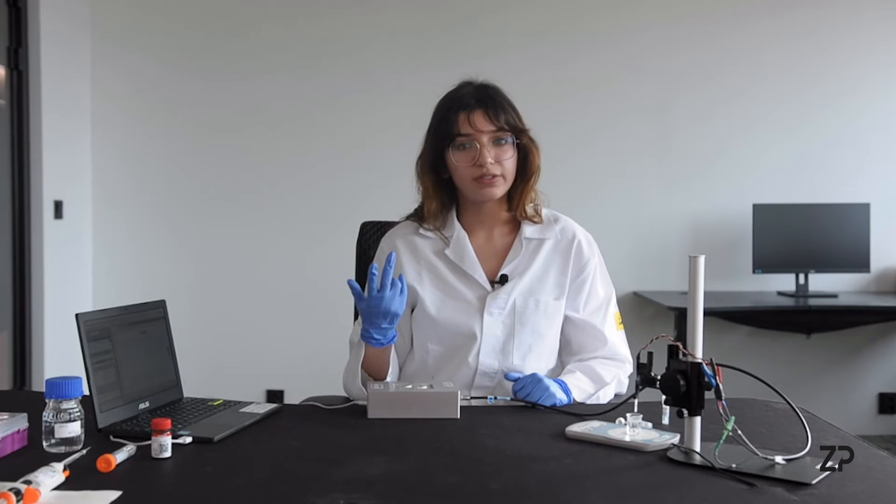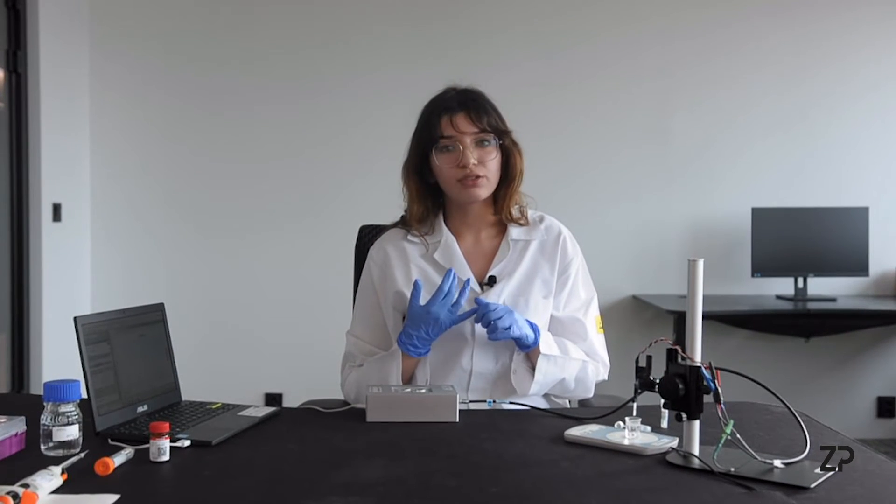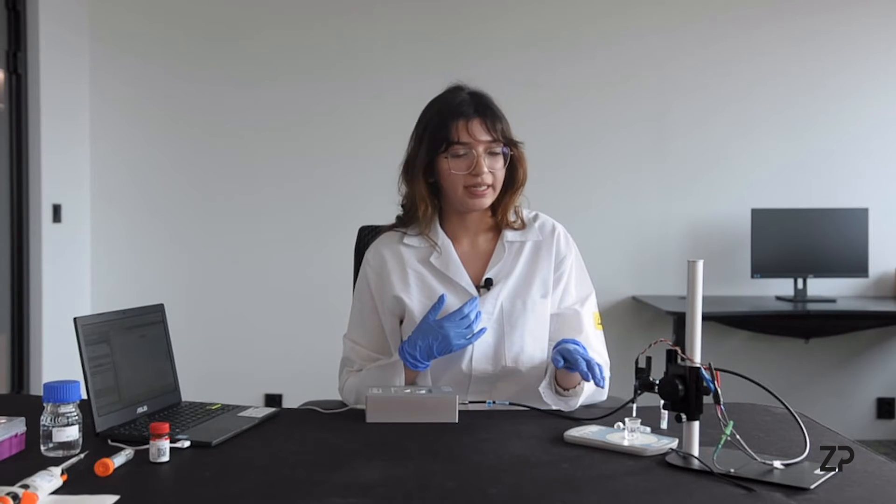There are two sorts of tests that you can do to run the lactate sensor. You can do a drop test or a beaker test, but for today we are doing a beaker test.